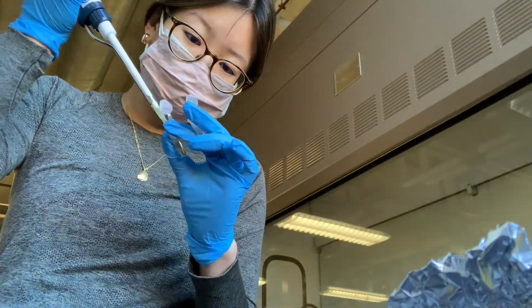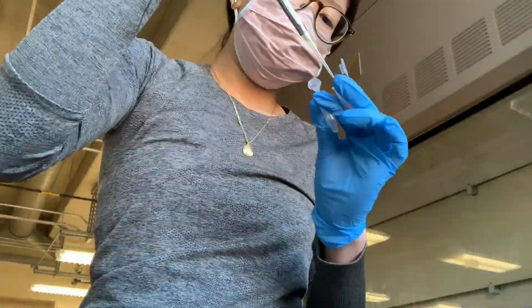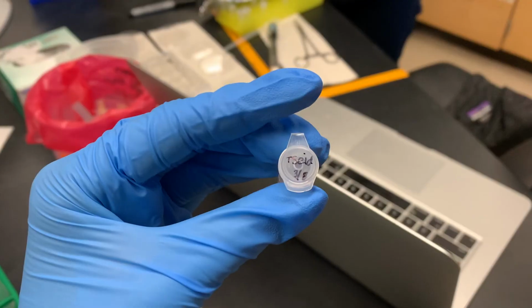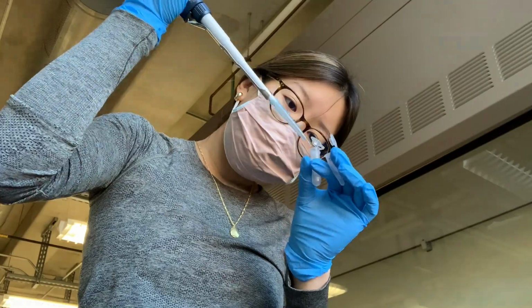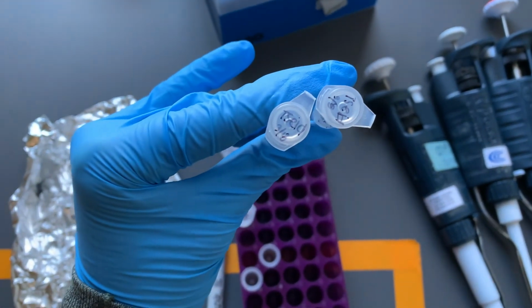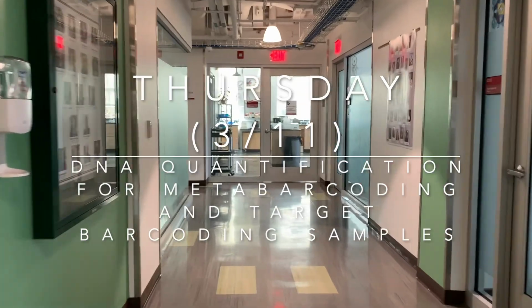After an hour had passed, I repeated the same procedure that I followed for DNA extraction on the metabarcoding samples for these 2 target barcoding samples. So that includes the AL buffer and ethanol, then centrifuging, adding AW1, centrifuging, AW2, centrifuging again, and finally the elution steps. Once I was done, I added each solution for the samples to an epitube, and it was time to call it a day. On Thursday, we're going to quantify the DNA in each sample using the Nanodrop instrument.